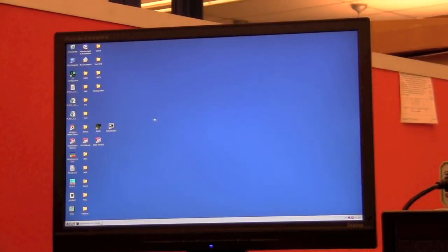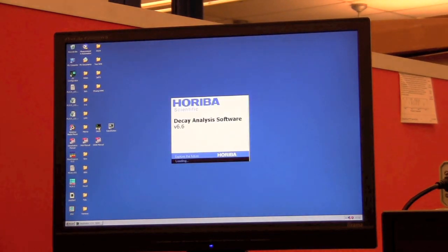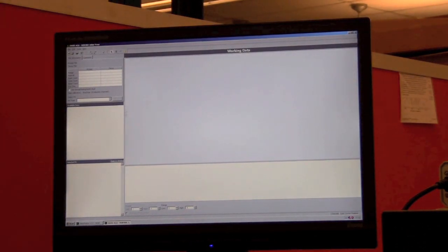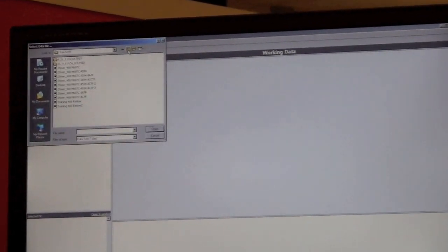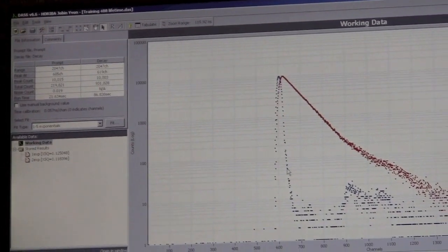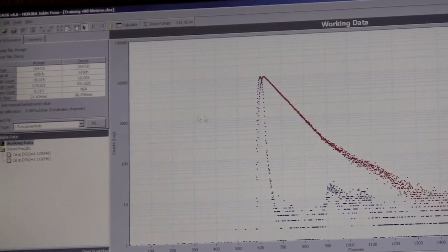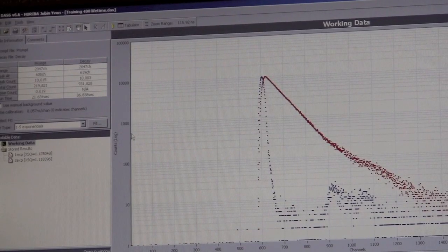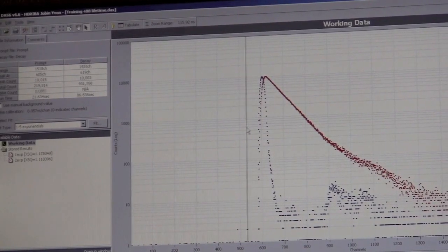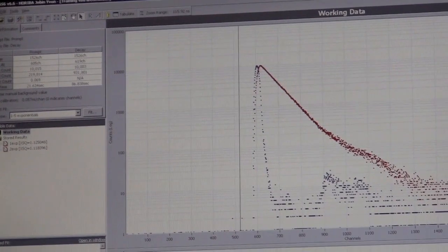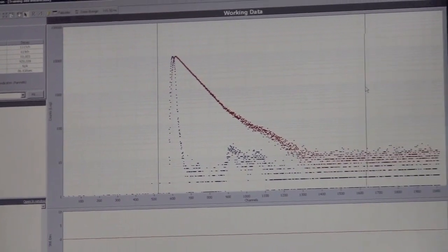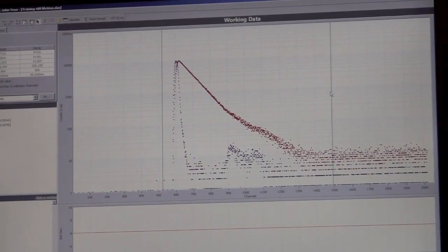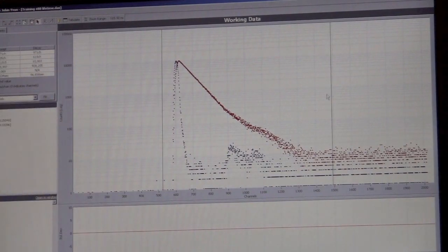Now that we've acquired our lifetimes, we want to fit each decay profile with the exponential equation. We do this using the decay analysis software. We open our file in our folder. You'll see your prompt in blue and your decay in red. You want to constrain the data you fit by moving these right and left-hand lines to where your data is contained within the file.